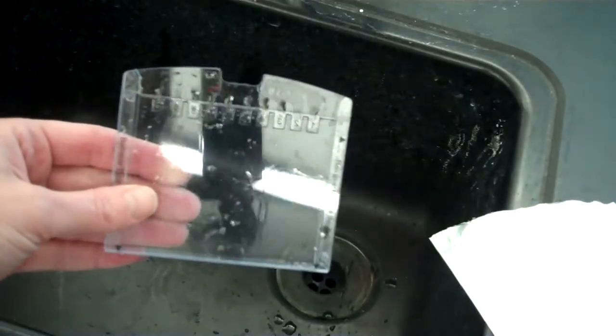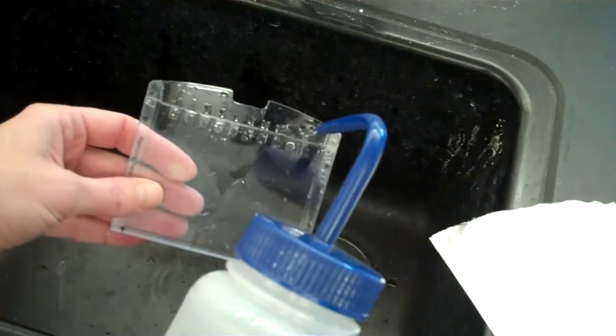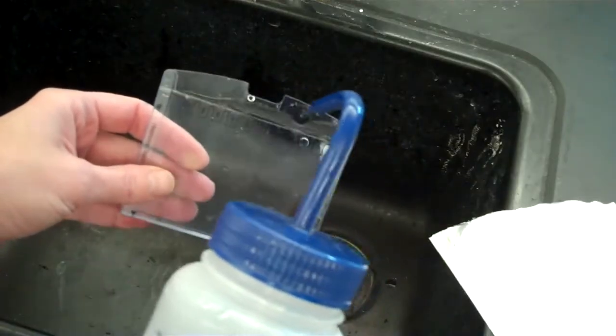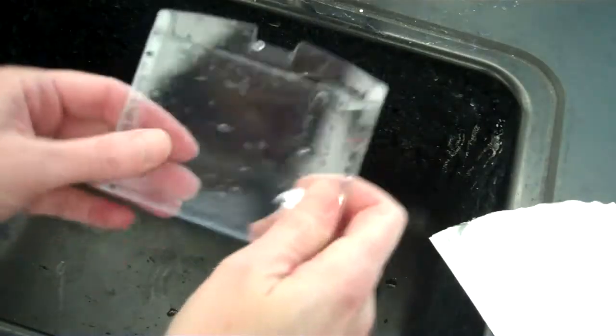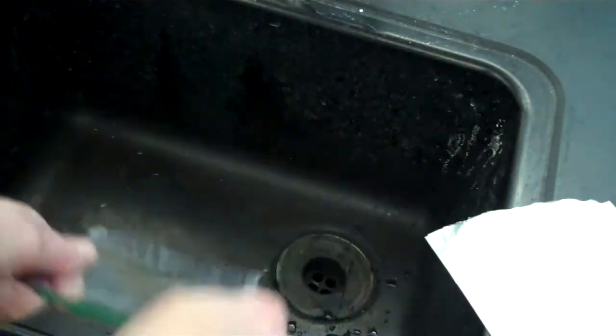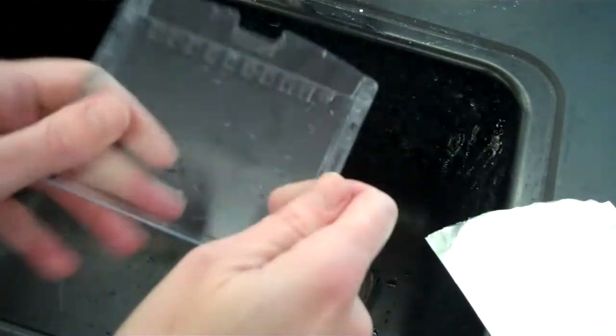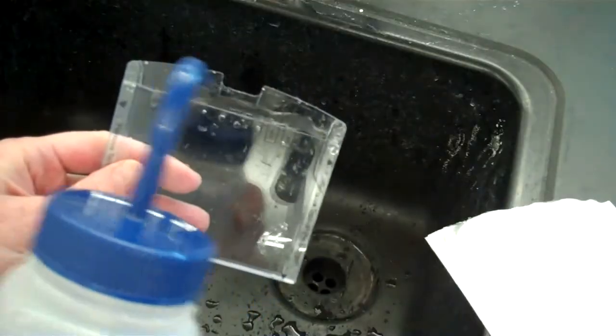Next we want to rinse the lanes. Take a bottle of deionized water and squirt some deionized water into the lanes. This is over a sink. And then grasp it firmly and flick. And that will remove the water from the lanes. Repeat this.